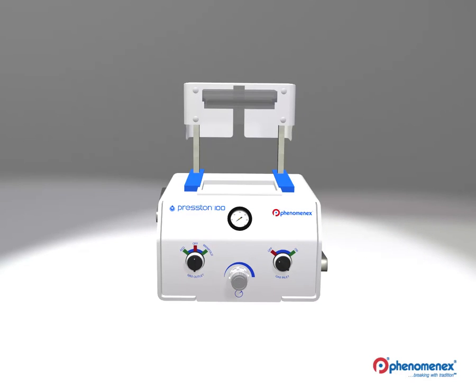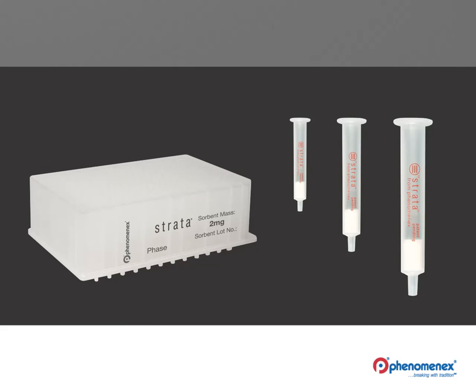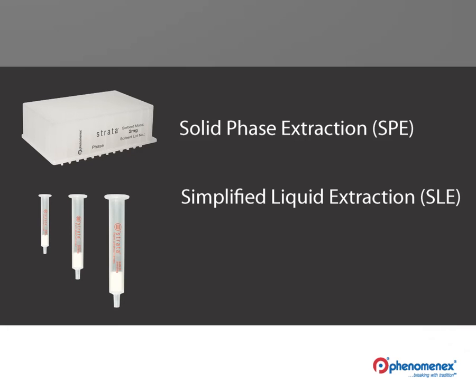Introducing the Preston 100 Positive Pressure Manifold, your newest solution to increase productivity. Preston is ideal for processing 96-well plates as well as 1, 3, and 6 milliliter tubes, and can be used to perform a variety of sample preparation techniques including solid phase extraction, simplified liquid extraction or SLE, and protein precipitation.